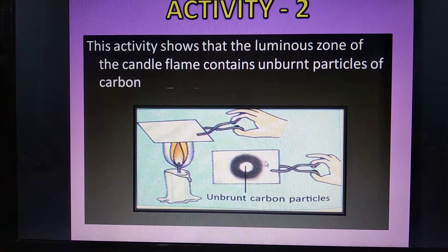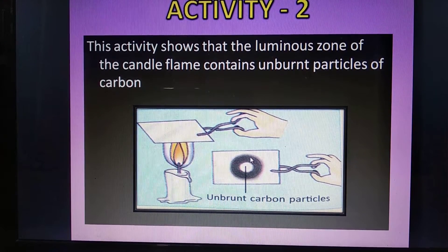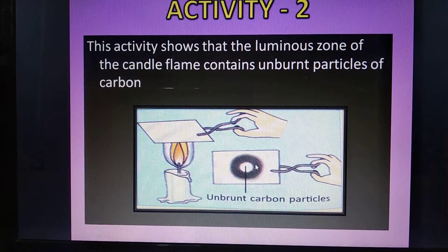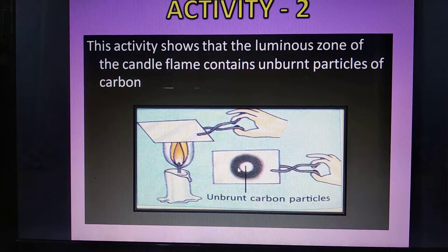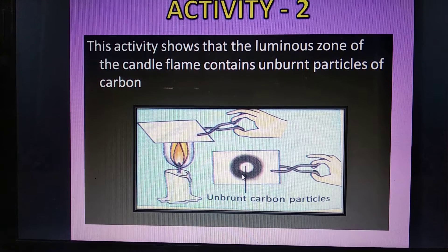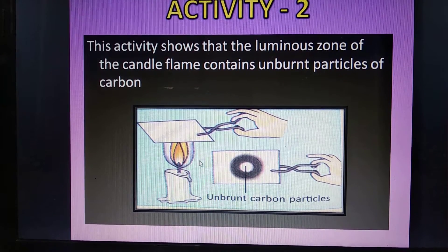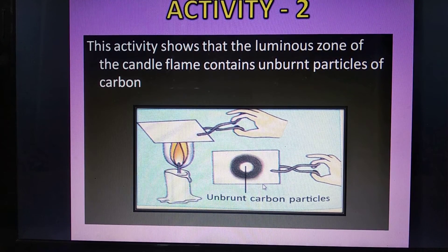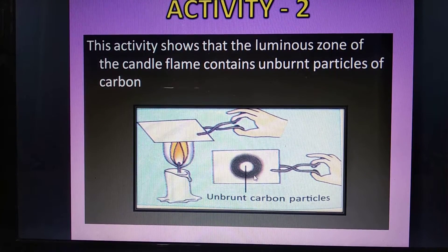We will find that a blackish ring is formed on the glass plate. This blackish ring is produced due to the deposition of unburnt carbon particles present in the luminous zone of the candle flame. This activity shows that the partial combustion of wax vapors in the middle zone produces unburnt carbon particles.